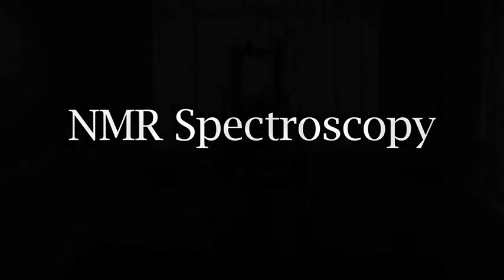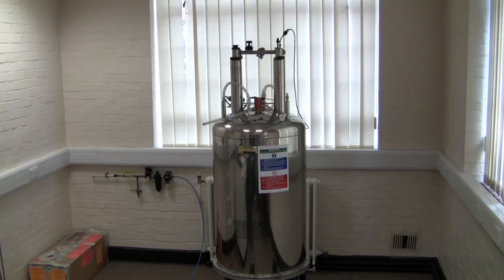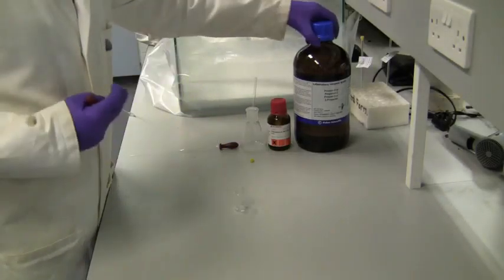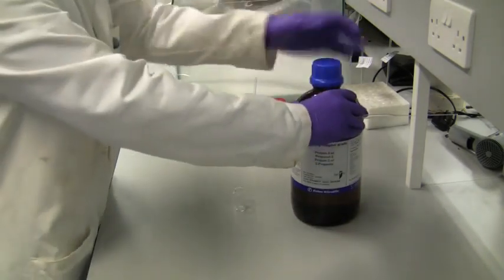In this video, we will see how an NMR sample of propan-2-ol is prepared and how the spectrum is obtained using an NMR spectrometer. In the lab, a few drops of the sample, in this case a liquid, is placed in a sample vial.